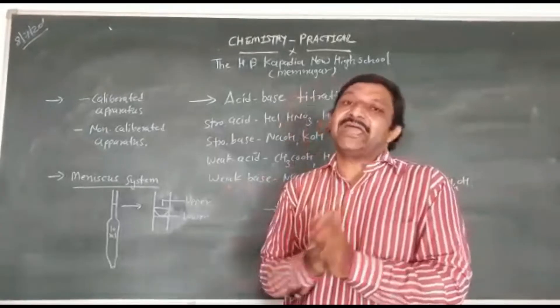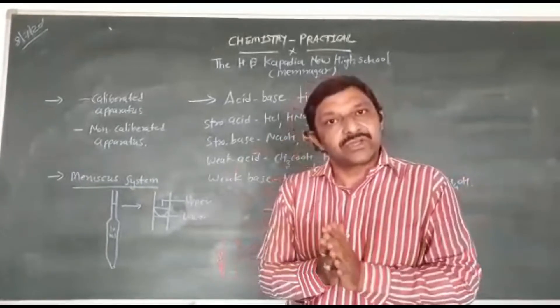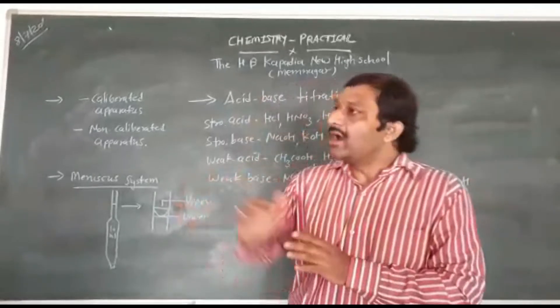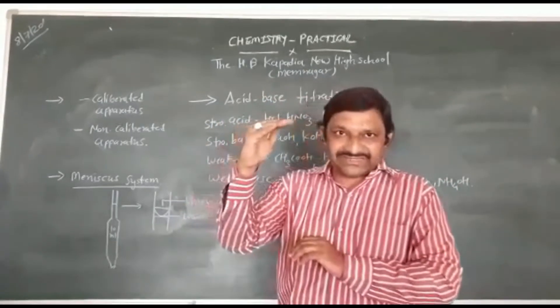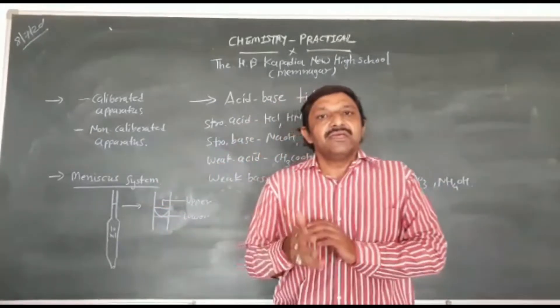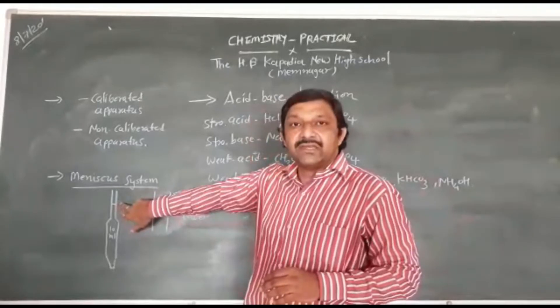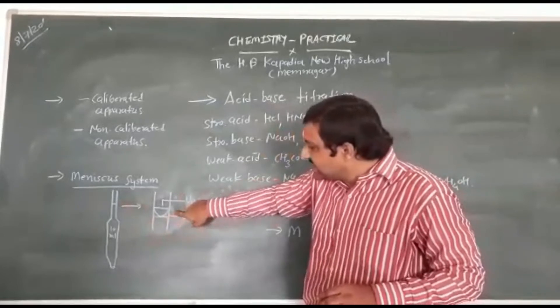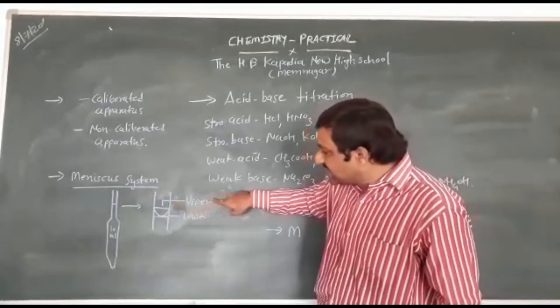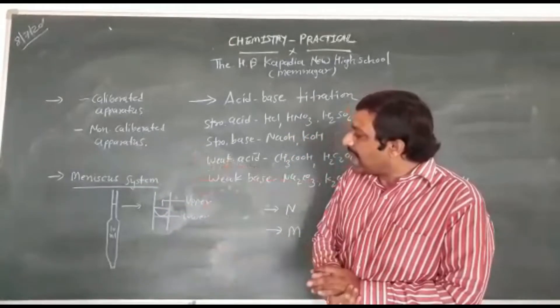In the case of colored solution and colorless solution — in 11th standard all solutions are colorless, so we will take the lower meniscus. In the case of a colored solution, we will take the upper meniscus. Here on the pipette, the sleeping line represents the upper meniscus, and the half circle represents the lower meniscus.